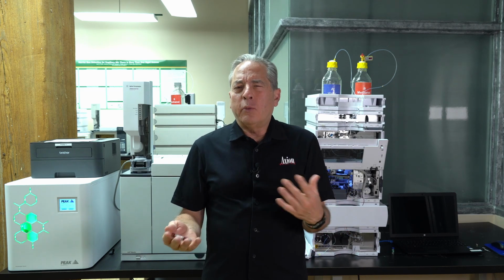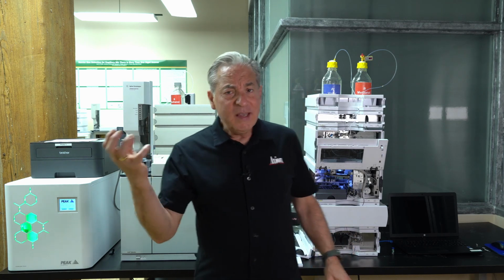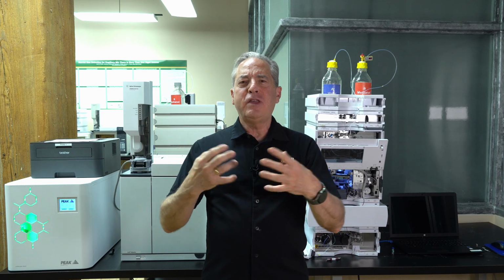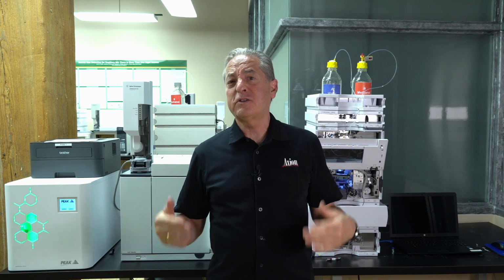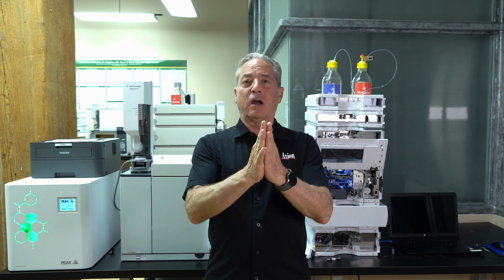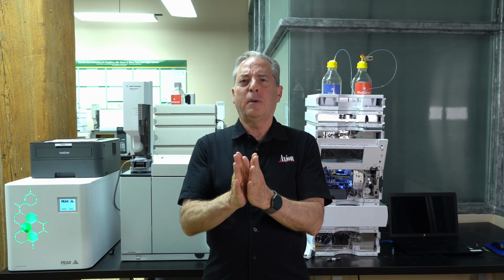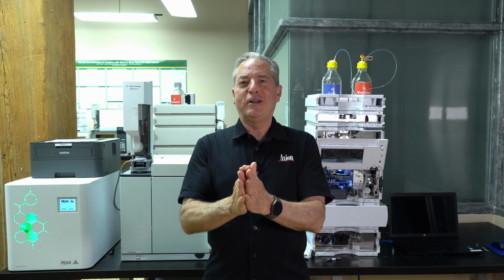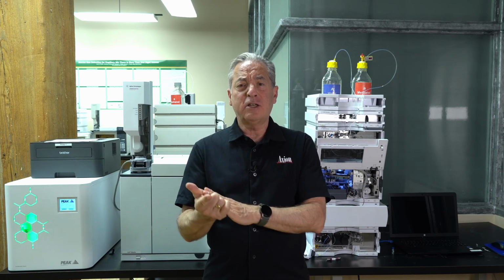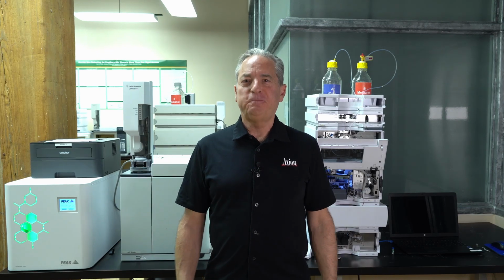So if we look at the ratio of that, it's called the capacity factor or retention factor, we're looking at essentially the amount of time in the stationary phase relative to the amount of time in the mobile phase. If you think back to PChem, back to physical chemistry, we talked about partition coefficient. So this essentially establishes that chromatography works based on real physical chemical principles, and that is partitioning. Okay, that's sort of deep in the weeds, right? So if we come back out and we say the easy answer, capacity factor or retention factor, we want it to be between 1 and 5. That is the magical answer.